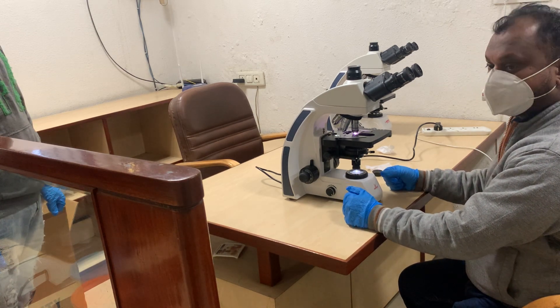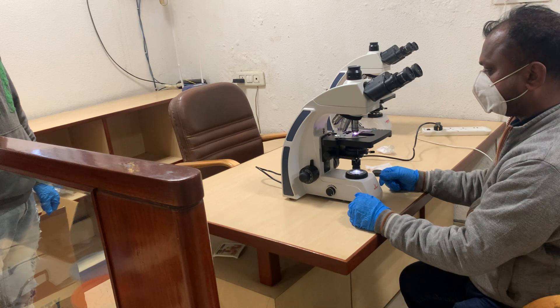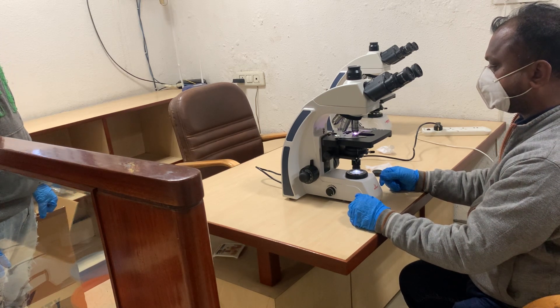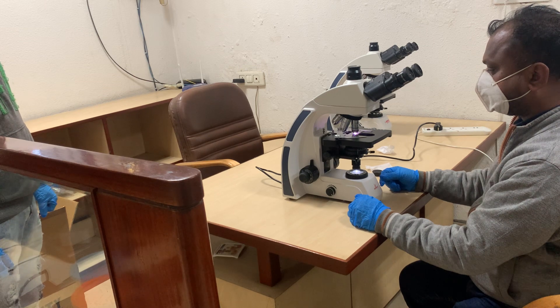This microscope is equipped with 10x by 22mm FOV eyepieces with diopter adjustment. It also has a trinocular port, so if in the future you require a camera system, you can always upgrade to one.